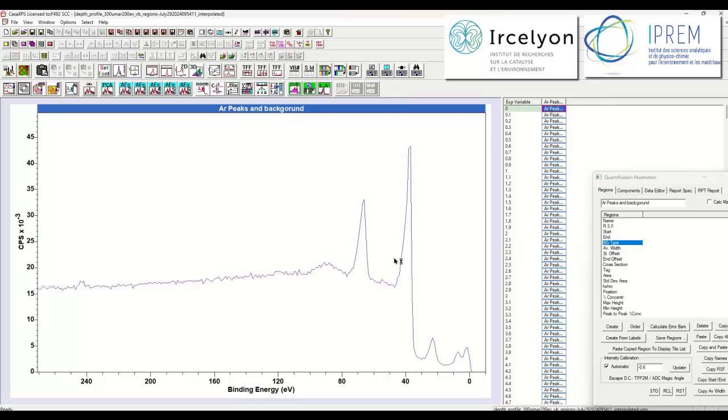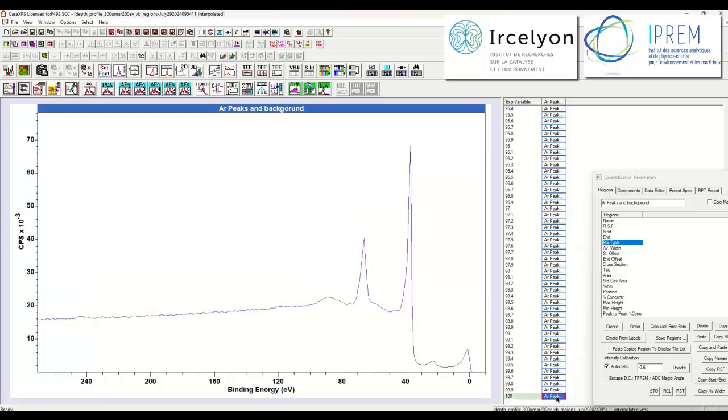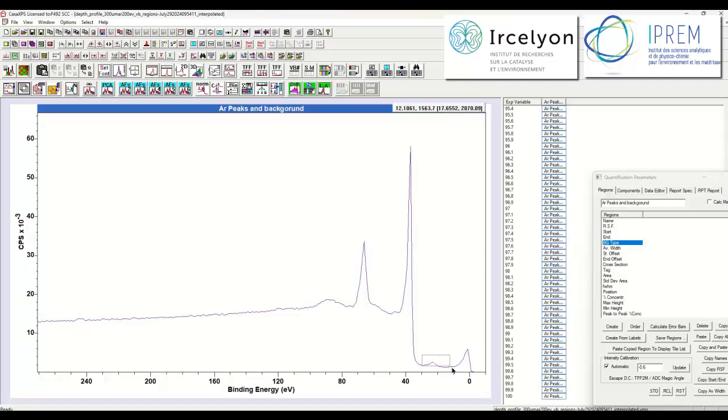Now the first one represents oxide. You can see that this has got oxygen in it, much more oxygen than the last one in this list. So I'm going to the end of the list and we still see a bit of oxygen. So when I go up this list, subtracting the oxide, we ought to be able to remove the peak that we see here.